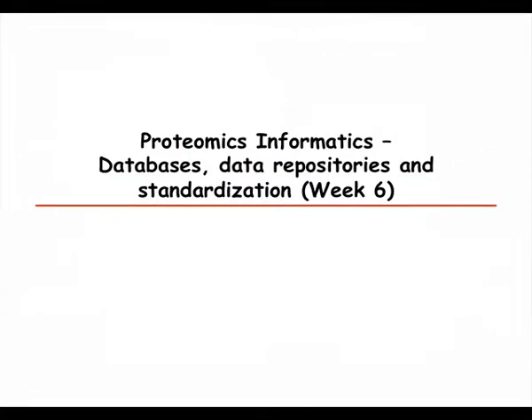So this is what I wanted to go through today. The main thing is that there are a lot of different data formats, repositories, and standards. All these are still quite a bit in flux, so it's changing a lot.